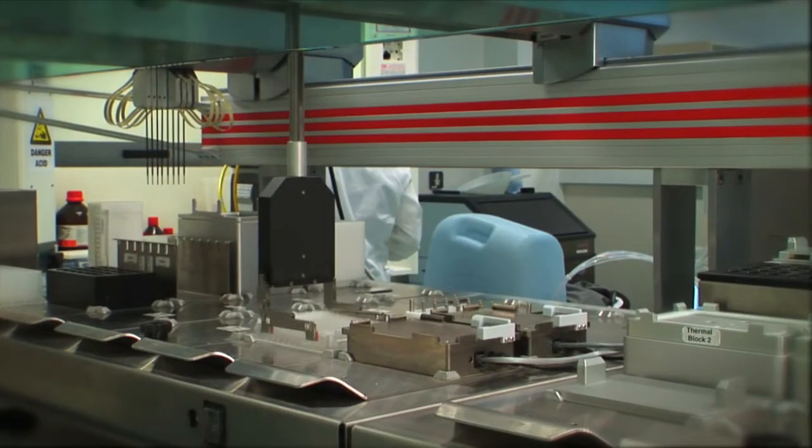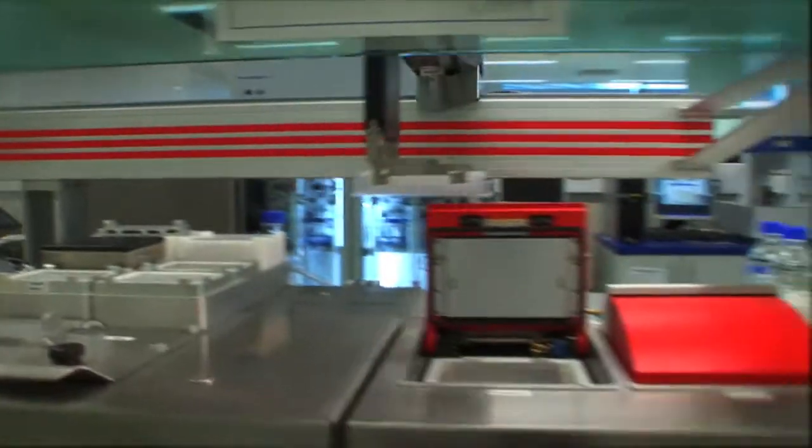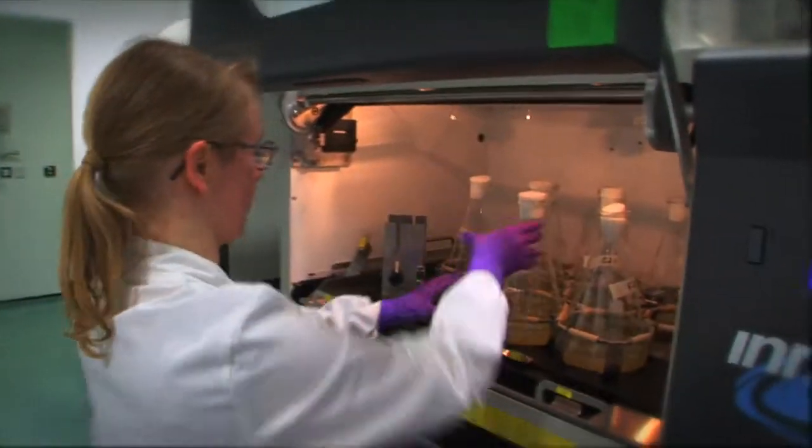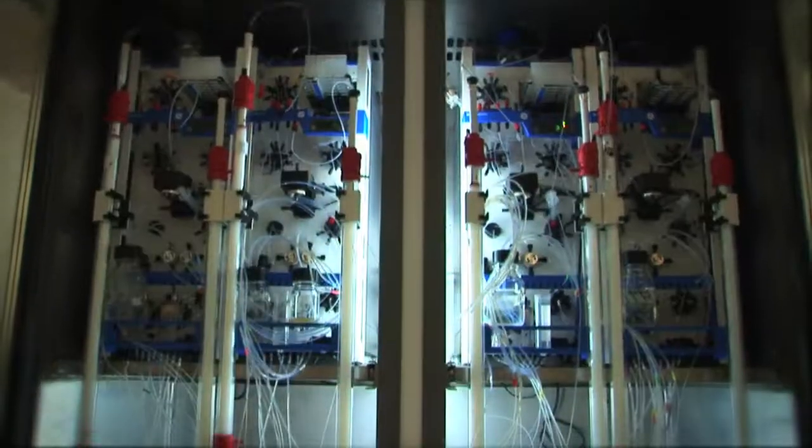We start with the DNA - this is the code which will tell us what the protein is. We select from our catalogue the DNA codes and then we use bacteria cells to actually manufacture the protein itself. Then we take the protein out of the bacteria using various machines and instruments that we have in the laboratory.